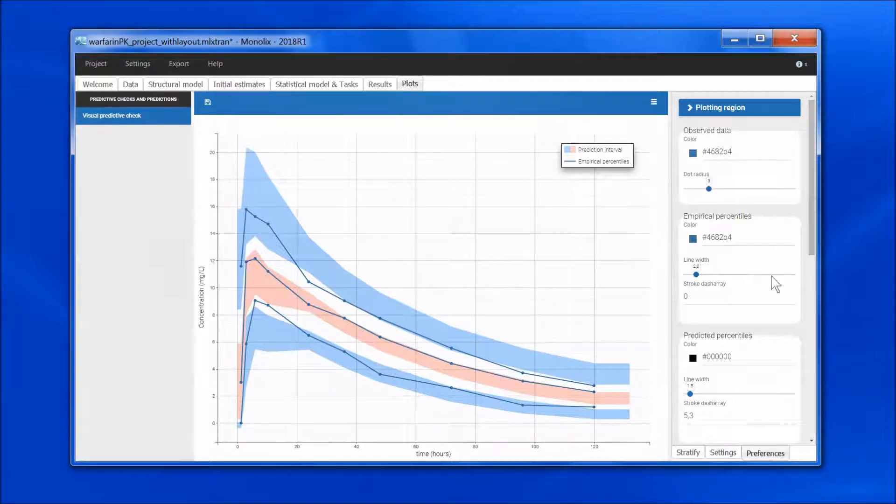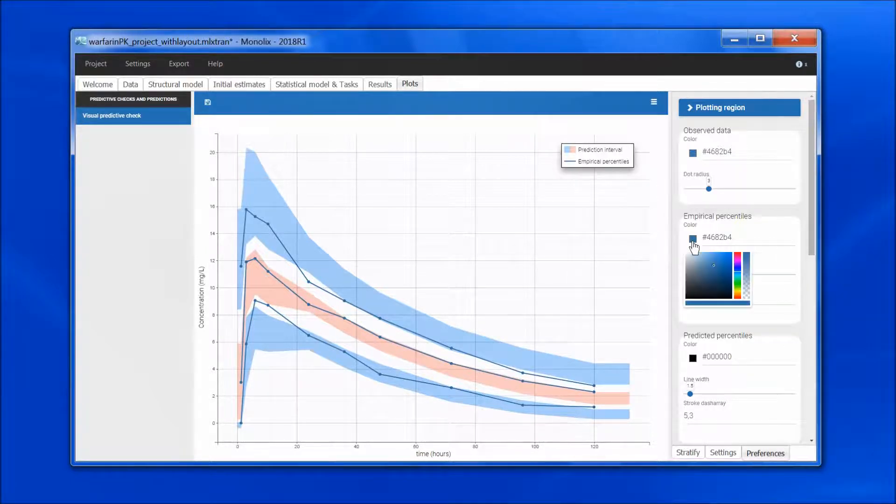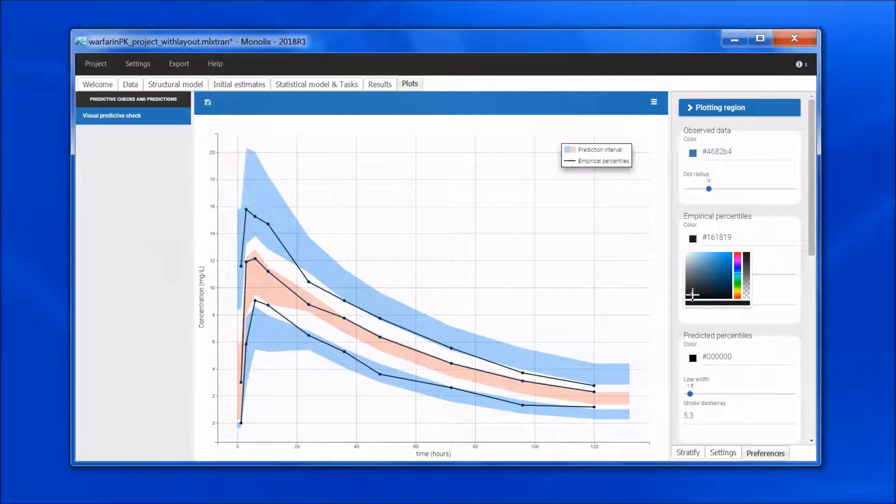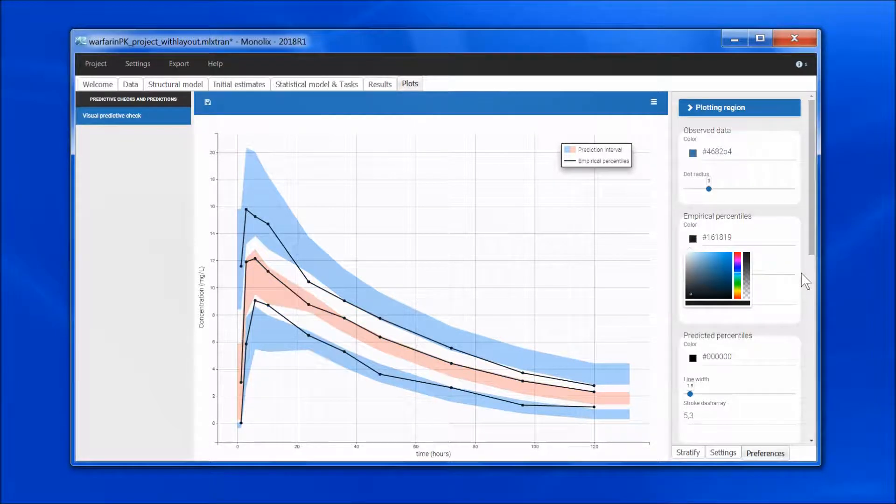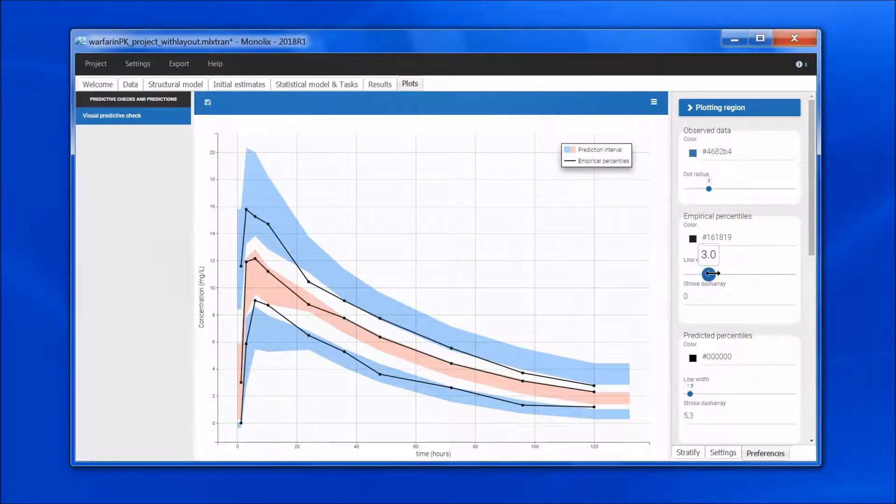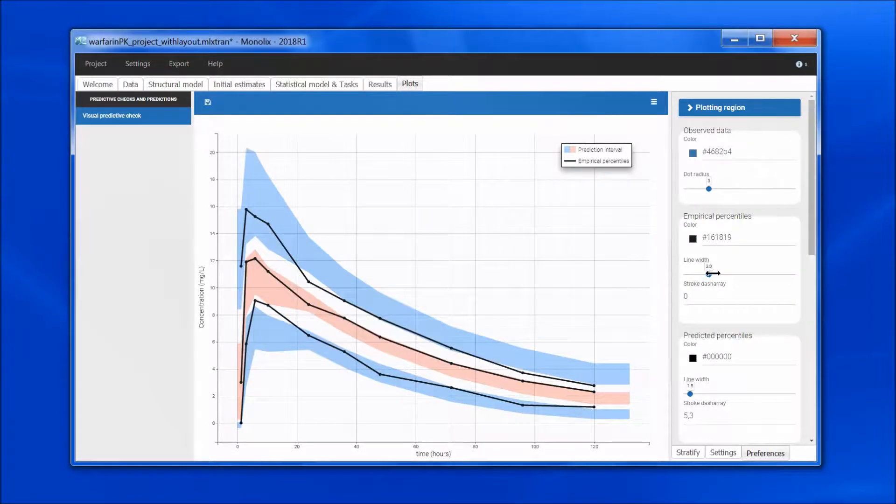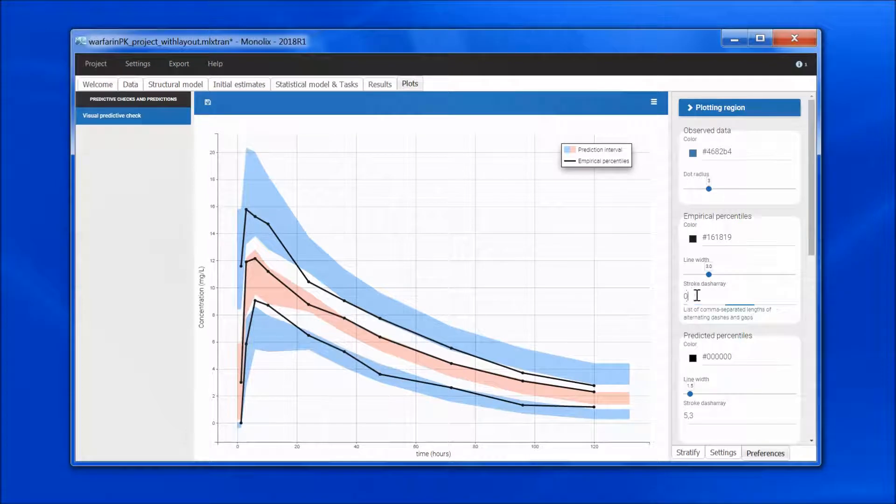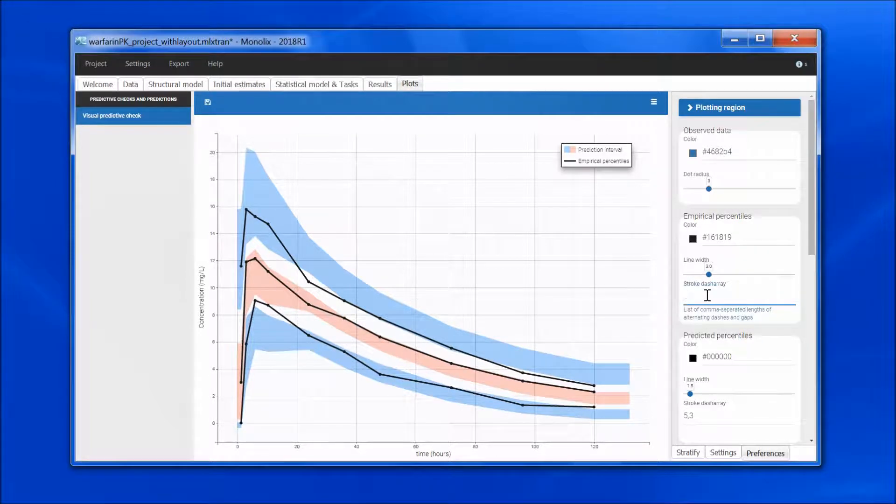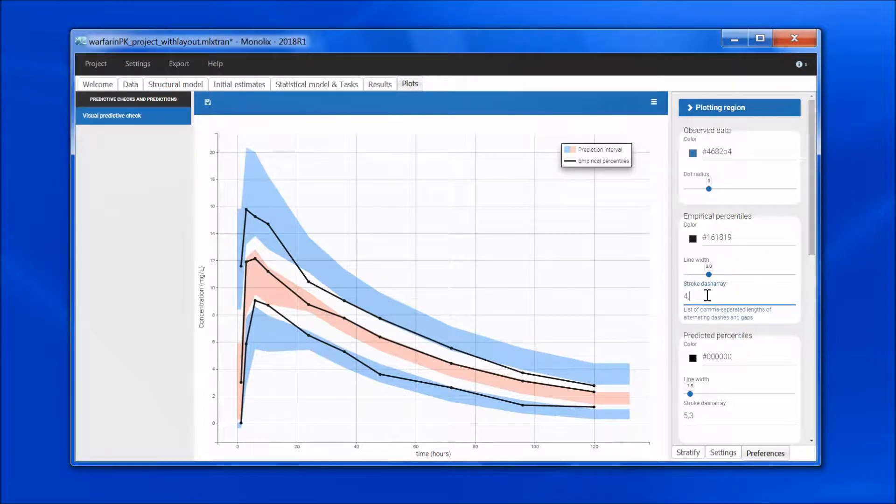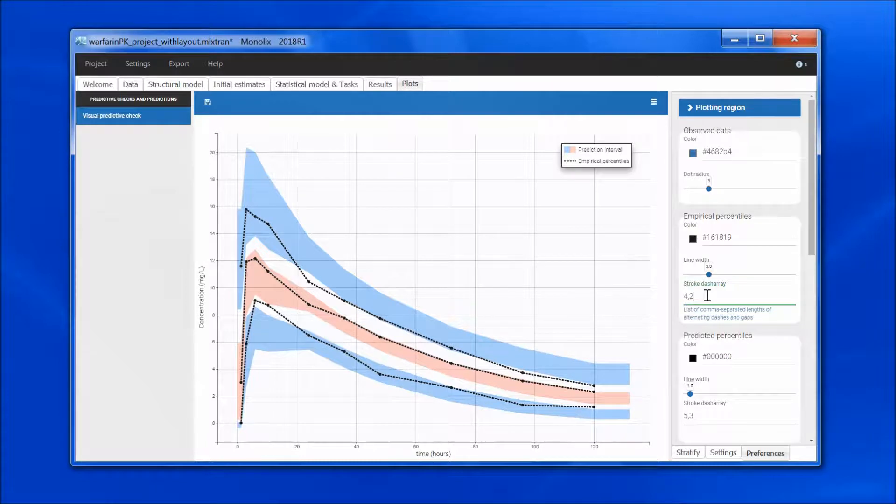I will for instance set that the empirical percentiles are black, that the line is a bit thicker, and I can also choose to have it dashed, for instance with a 4-2 pattern.